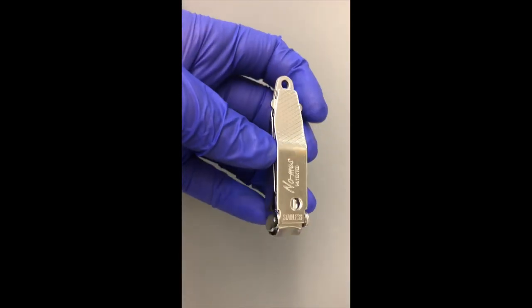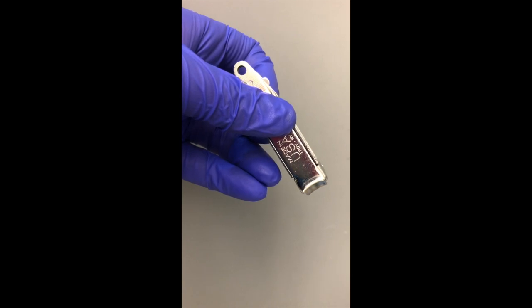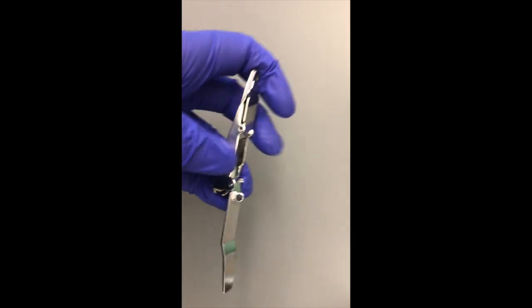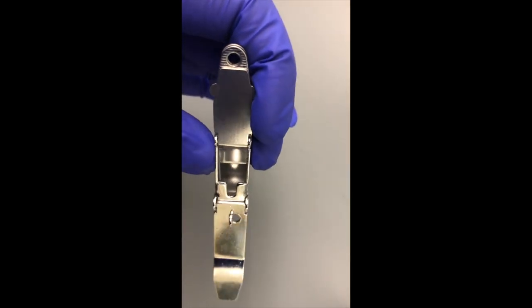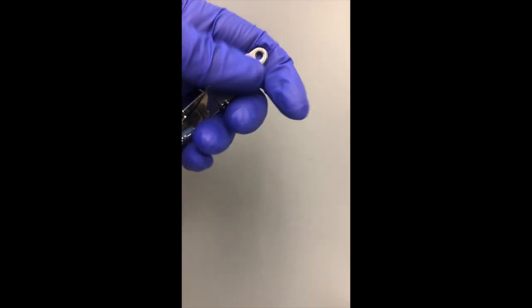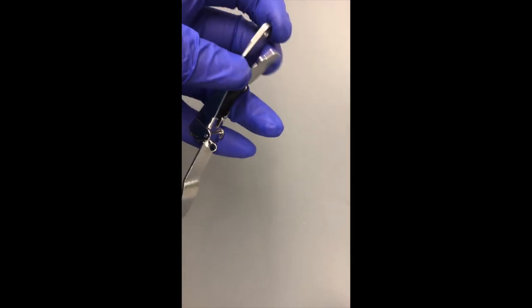Unlike most DNA extractions, some extra preparations of the sample were required. Because spines are such a tough plant tissue, they had to be clipped into tiny pieces so that the genetic material could be isolated from the cells. I used nail clippers that had a compartment to capture all of the fragmented spine pieces.